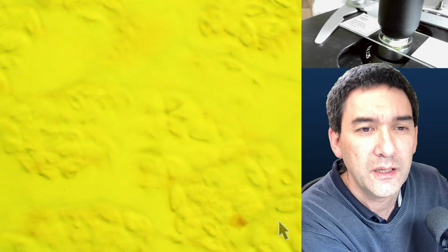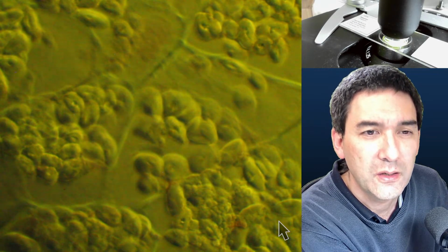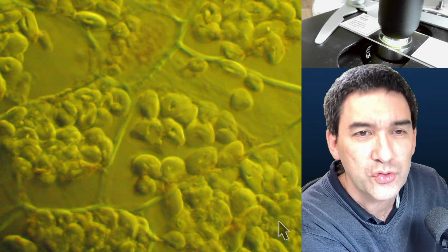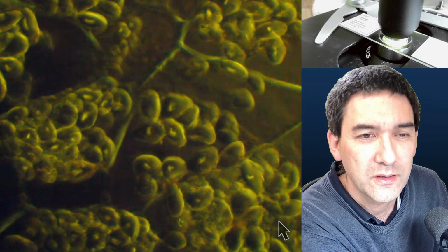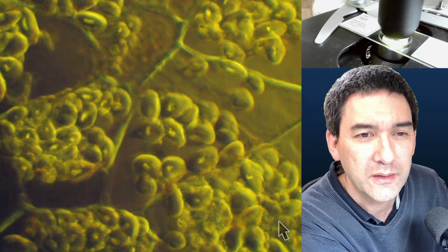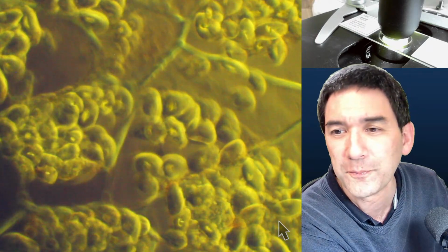Let's go up a little bit here again. Here you do see a really strong oblique effect. Again, a combination between Rheinberg and oblique, and starch grains of a wheat grain.